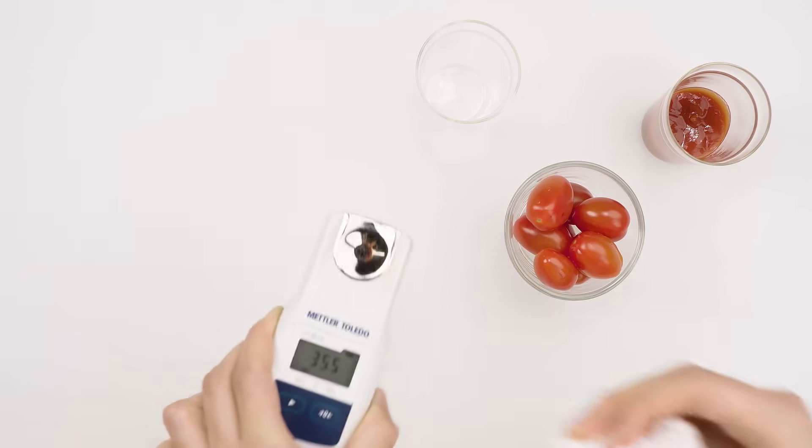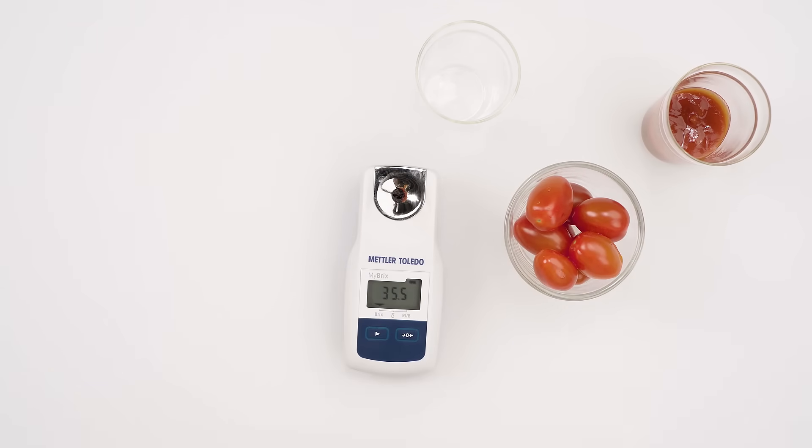Always remember to clean your instrument thoroughly, especially with dense and sticky samples.